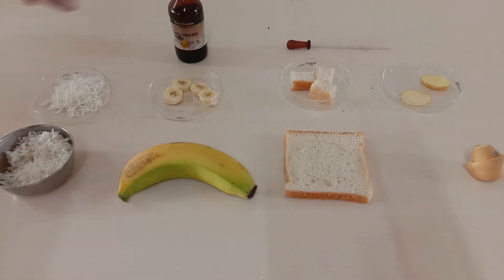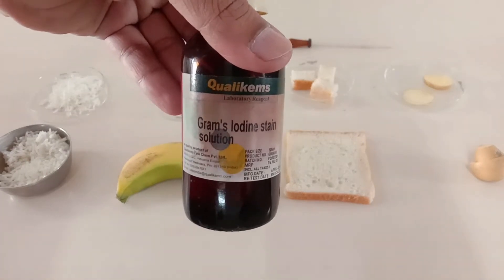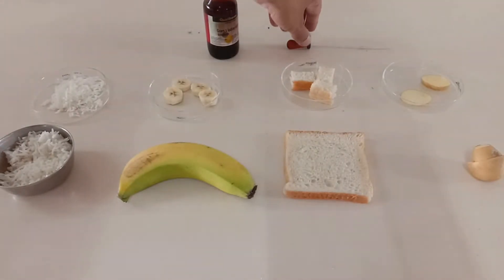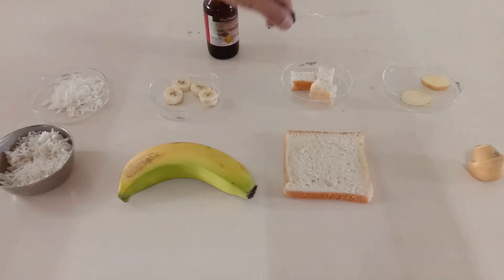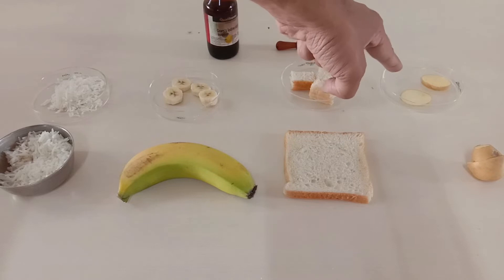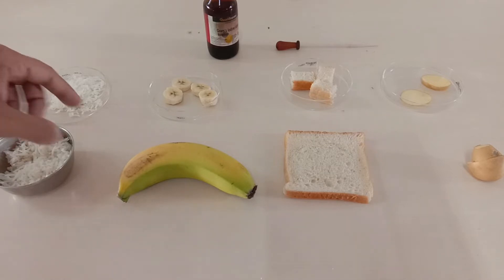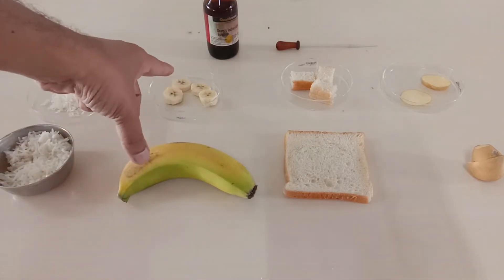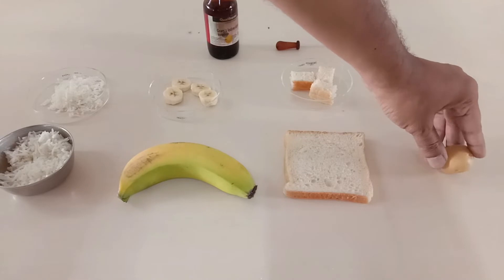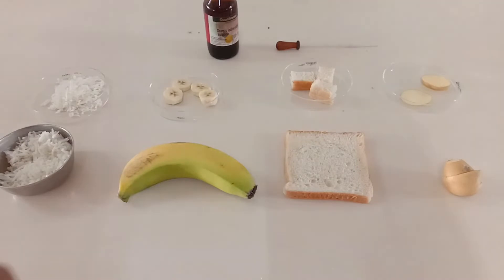So let's begin the experiment. For this experiment we require an iodine solution and a dropper, along with a few food items. I have taken some boiled rice, some banana pieces, some pieces of bread, and some pieces of raw potato, and I have kept them in different watch glasses.